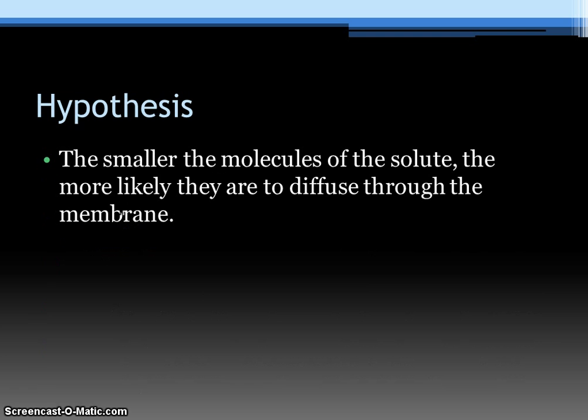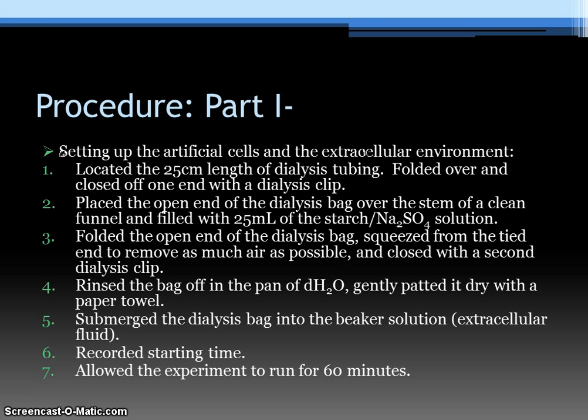For this experiment, our hypothesis was that the smaller the molecules of the solute, the more likely they are to diffuse through the membrane. In this case, the membrane would be the dialysis tube. So for our first part of the procedure, we set up our artificial cell and the extracellular environment. And these are the steps that we used.